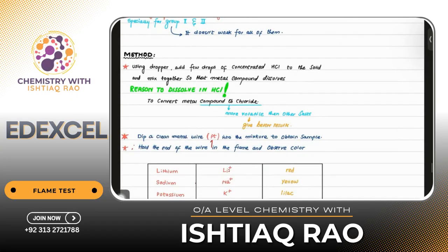Number one, using a dropper, add a few drops of concentrated hydrochloric acid to the solid. As you know, we cannot do a flame test directly. Let's say I have sodium metal. As we know, sodium is very reactive. When you provide direct heating to sodium metal, it can explode. To avoid this, we have other metals as well. So we never do a direct flame test of a pure metal.